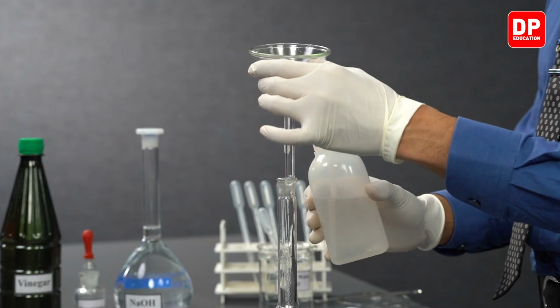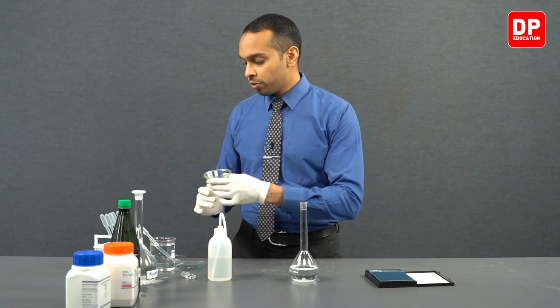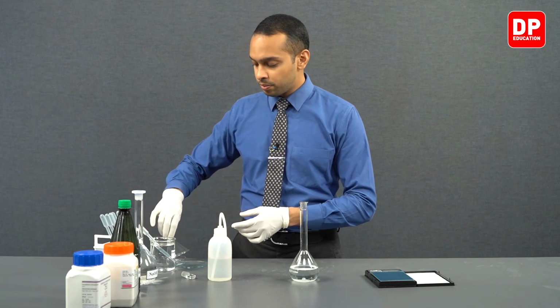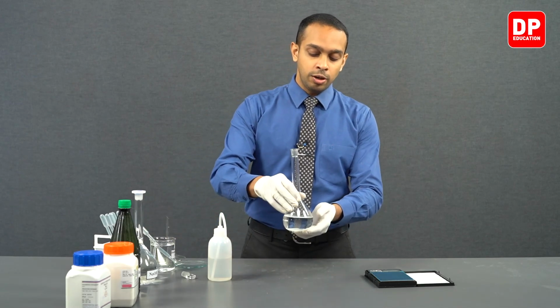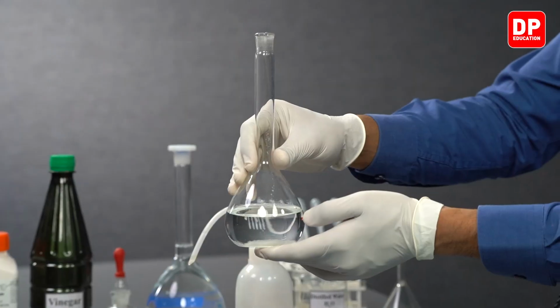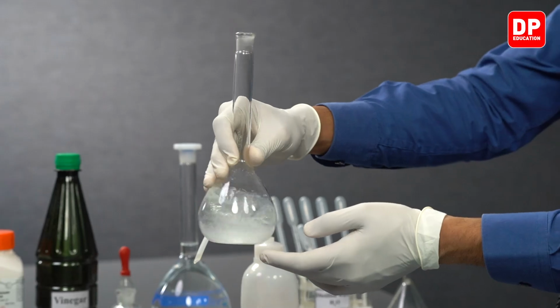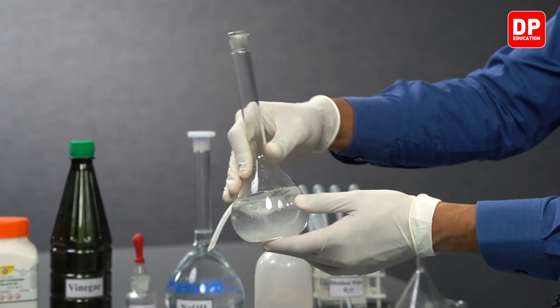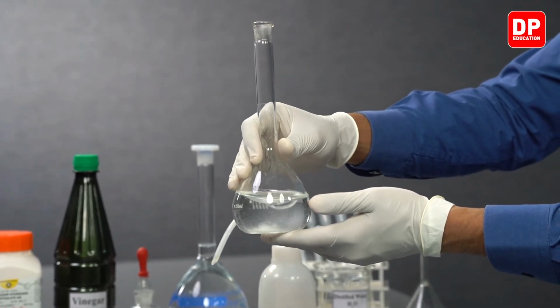After washing the tip of the funnel, we can remove the funnel from the setup, and we can now start stirring or swirling this solution to dissolve the potassium hydrogen thalate that is present inside our volumetric flask.